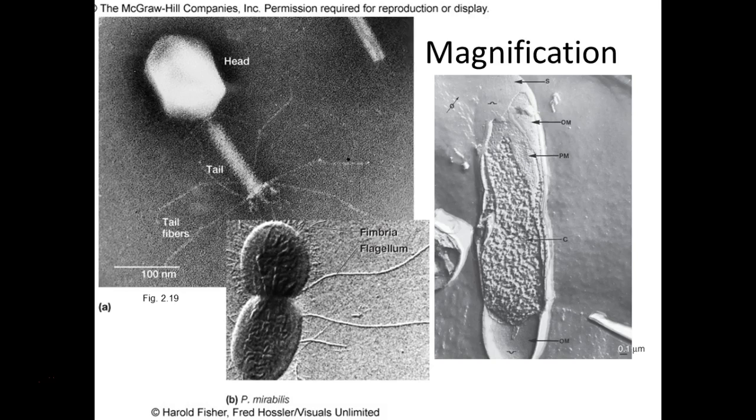If you see color associated with electron micrographs, it's because someone's colored it. You guys remember the old black and white images, and then they would go in and literally physically paint and color on them? The same thing can happen here, where they generate this black and white image and then add color to help people understand what they're looking at in the image.